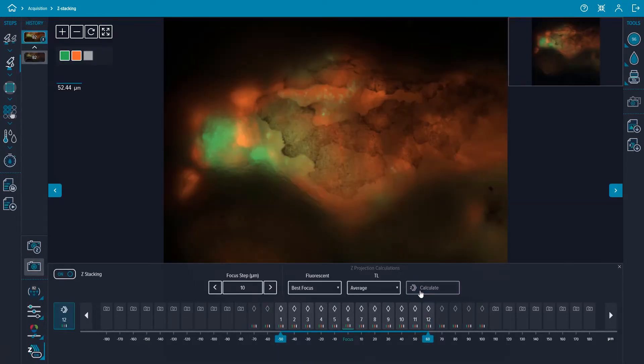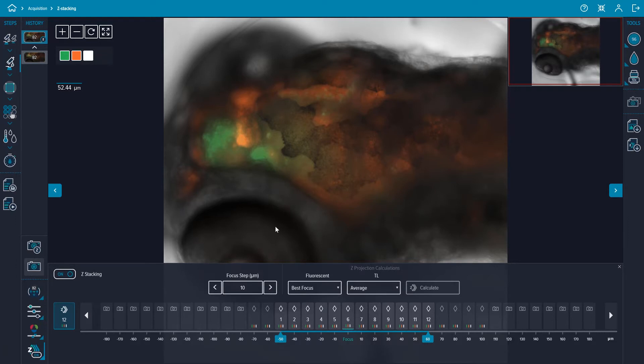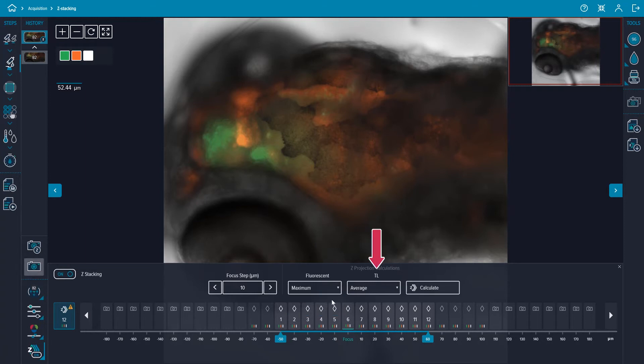Different types of z-projection images can be selected and tested without having to recapture the z-stack. Open the drop-down list for the fluorescent and TL fields, choose the desired z-stack projection and select calculate. The options for the fluorescent channels are best focus and maximum projection. For transmitted light, the options are average and best plane.